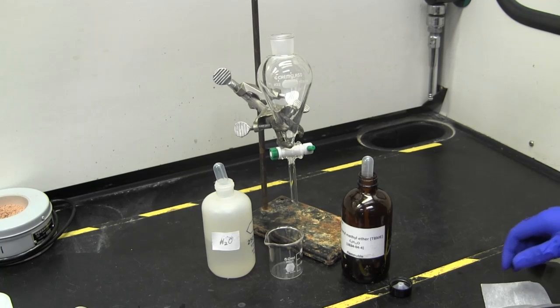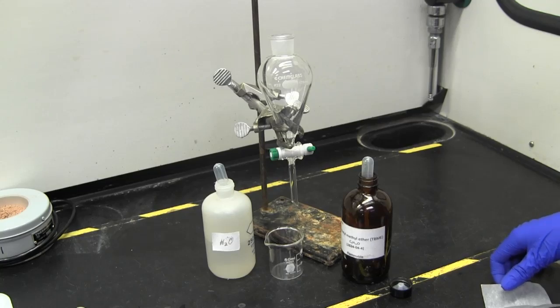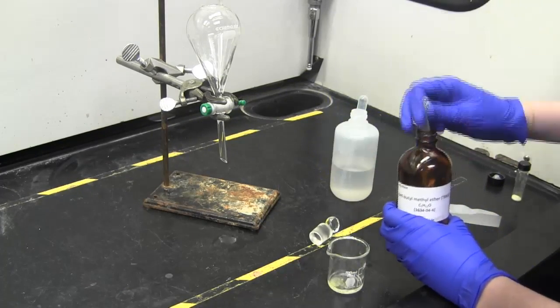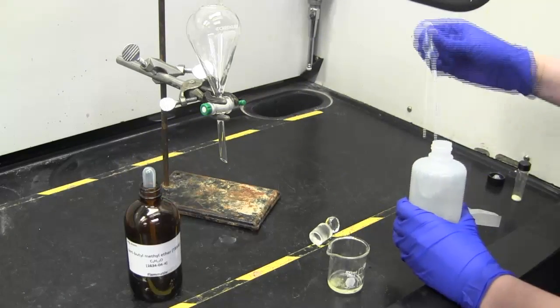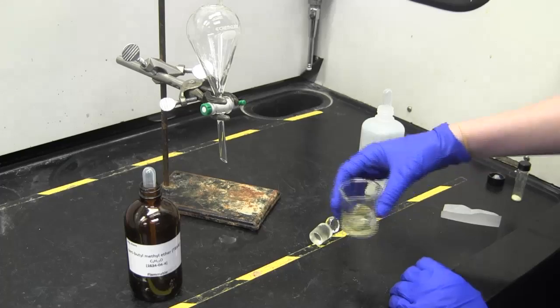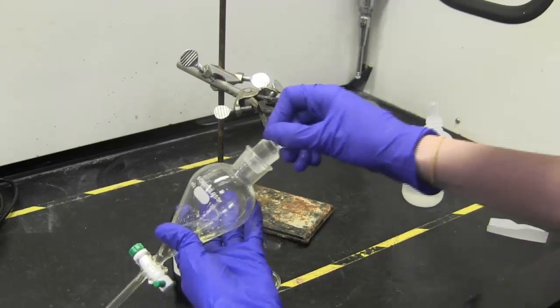For the large-scale method, you will use a separation funnel. First, check to see that the stopcock on the bottom of the funnel is closed. Then dissolve your unknown in the appropriate solvent. Pour the unknown solution into the funnel and place a stopper in the top of the separation funnel to prevent leaking.